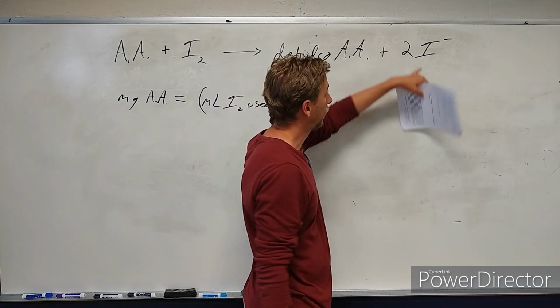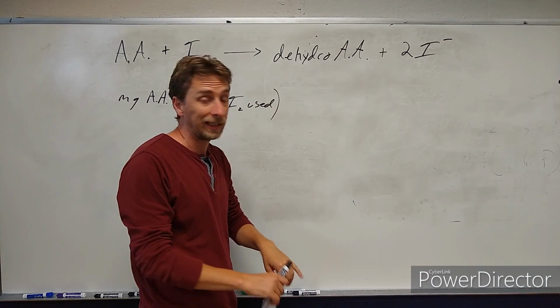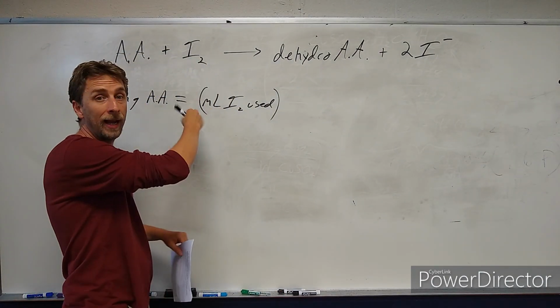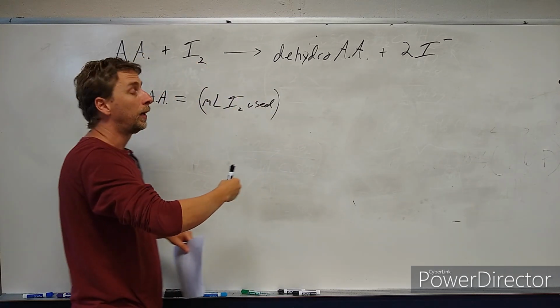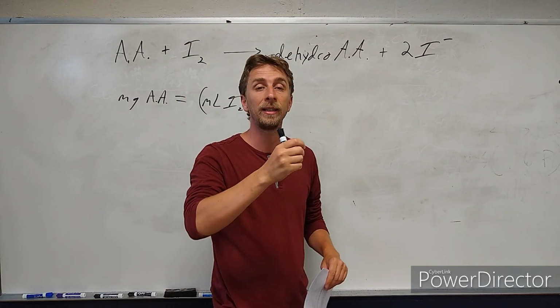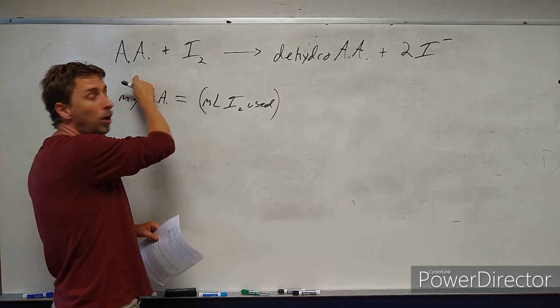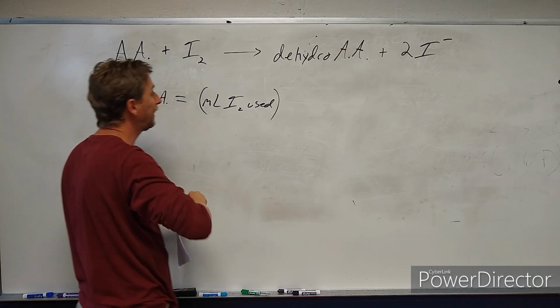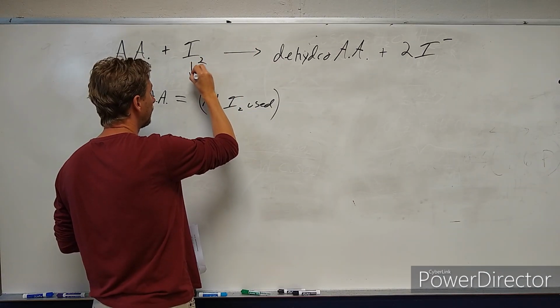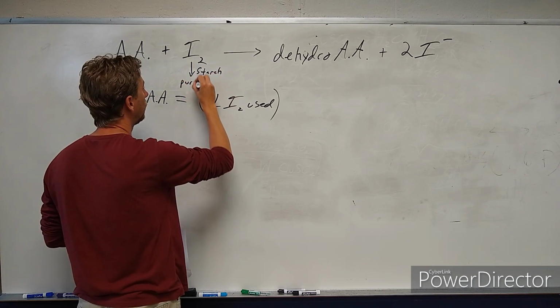The iodide over here doesn't react with the starch. So that's why it's colorless and clear after it reacts with all the ascorbic acid. Then you add a little bit more iodine, and it disappears again. Then you add a little bit more, and it keeps on disappearing until when? Well, it keeps on disappearing until you finally have 1 drop extra iodine, no more ascorbic acid, and instead the iodine hits the starch. I'm going to put it down here like this. Starch turns into a purple complex.